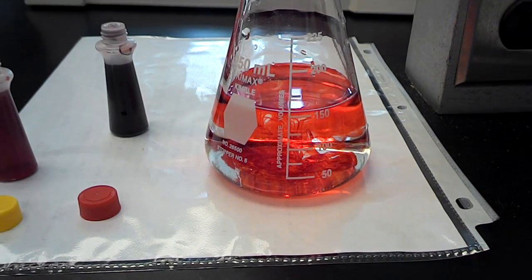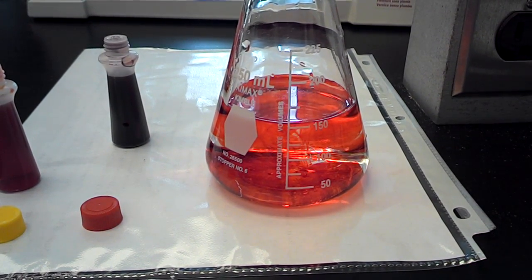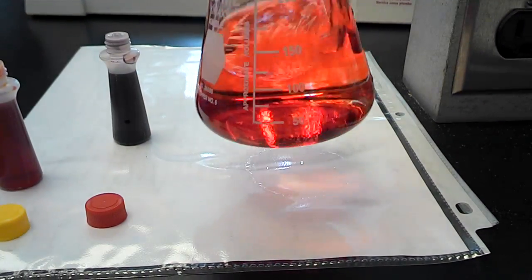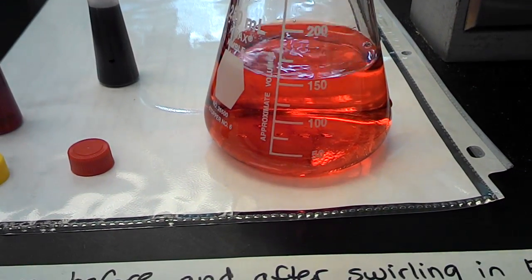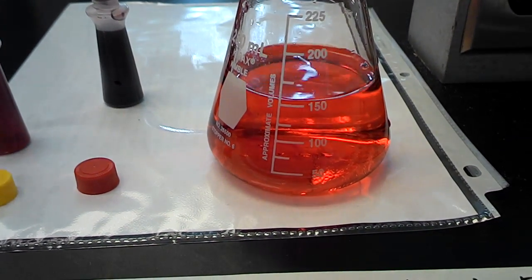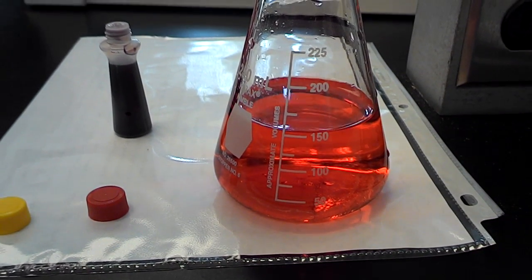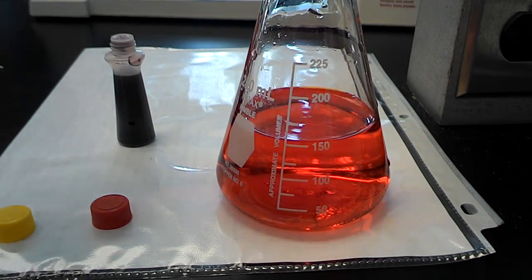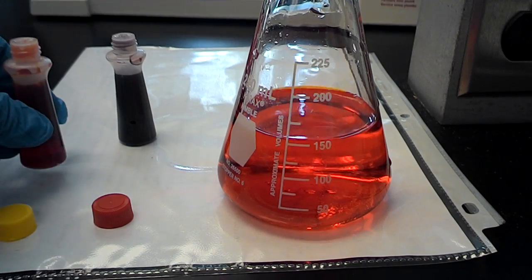So observe how the food coloring is dispersing into the water, dissolving into the water. So that's your first observation. Then you're going to swirl the Erlenmeyer flask and then make the observation after the swirl. Now you're going to add a couple of drops of a different food coloring, in this case yellow. It's kind of hard to tell. I'll add a few more drops.